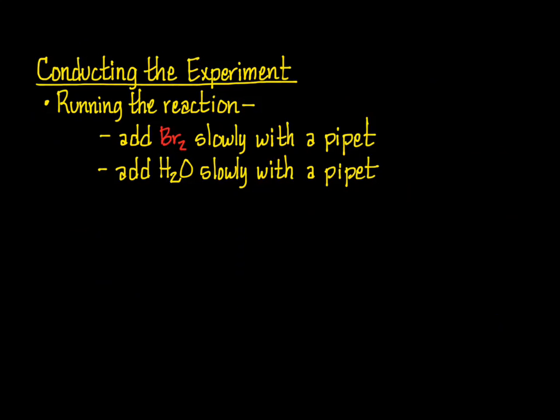Regardless of the color of the reaction mixture, the next step is to add water to precipitate out the crude product. This also needs to be done slowly, at least initially, by adding a few drops at a time from a Pasteur pipette. During the addition of water, the product will fall out of solution. In the case of aniline and acetanilide, the product precipitates out as a fine powder. Anisole, on the other hand, has a tendency to form an oil at this point. But with a lot of stirring and scraping of the oil against the sides of the flask, it will eventually turn to a solid.